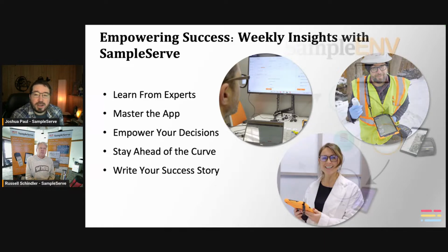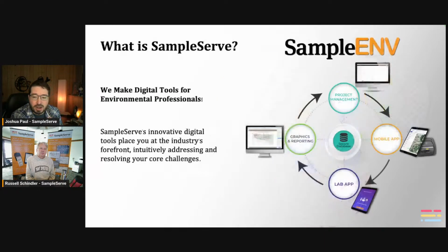So what are we talking about today? We're talking about Sample ENV. This is our environmental platform. This is for all types of media, drinking water, wastewater, soil, groundwater, pretty much anything. If you're putting a sample in a bottle, we can handle it with this platform.